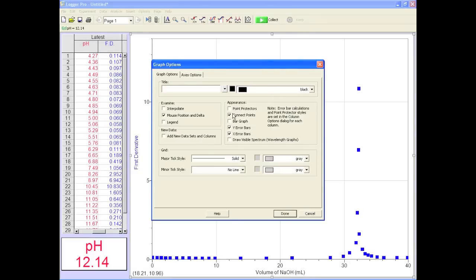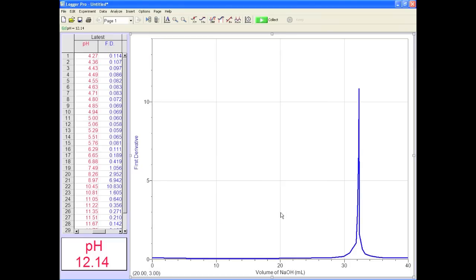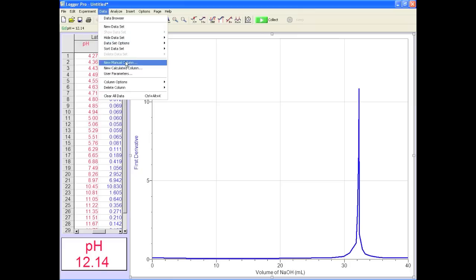If you did a killer job and got several points in the steep region, the top of the curve will be close to the equivalence point. For an even better indication of the equivalence point, a second derivative is better.